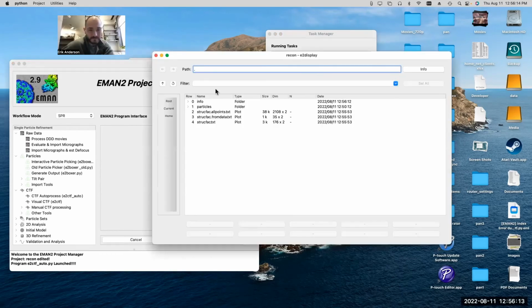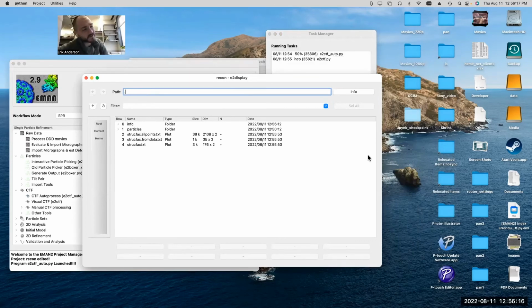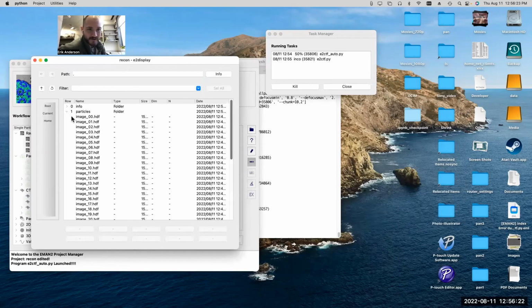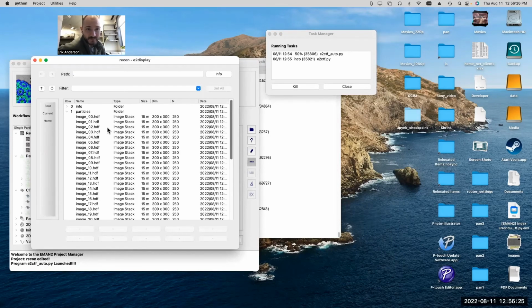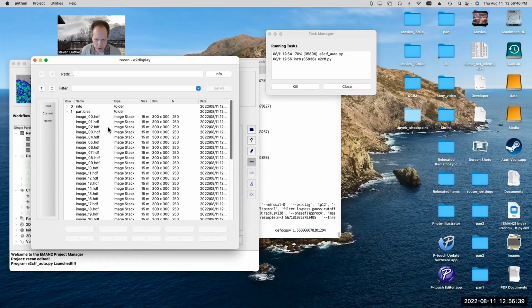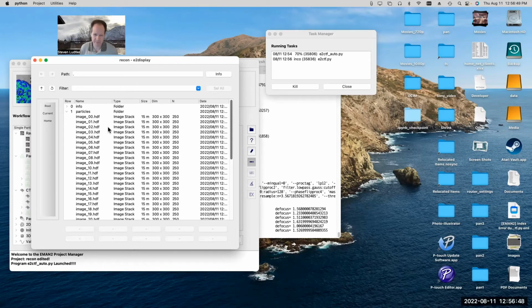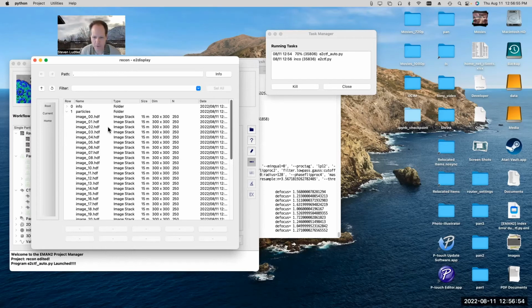So if we look, yeah, go ahead, ask. I was going to say this may be a good opportunity just for me to get a little bit more of the history, because CTF has been historically a big limiting factor for resolution determination for a long time. And it seems like, well, first off, am I right in that how you compute it, people compute the CTF differently in different programs, right? People determine the CTF with different programs. Right. You're right. There was like a CTF determination challenge, right, 12 years ago or something like that, where different software packages for determining the CTF were sort of competed against each other.